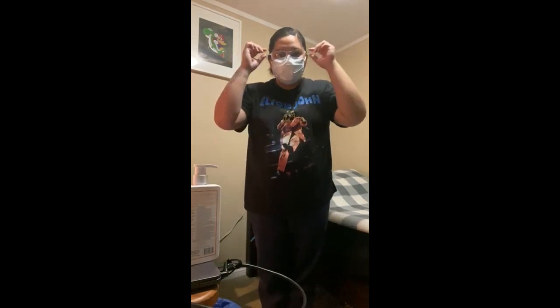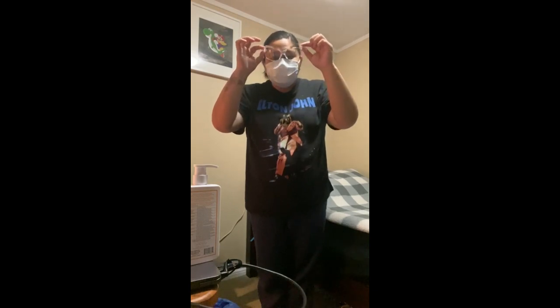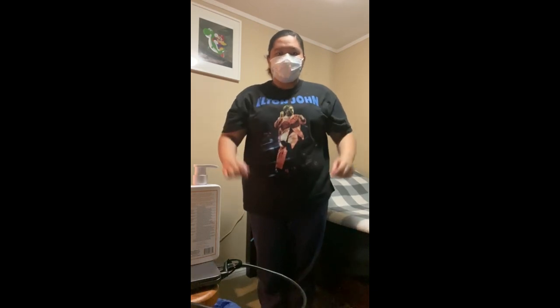Next is your eye protection. Handle only by the headband or earpieces. Carefully pull away from the face. Put reusable items in the appropriate area for cleaning or the disposable items into the garbage.